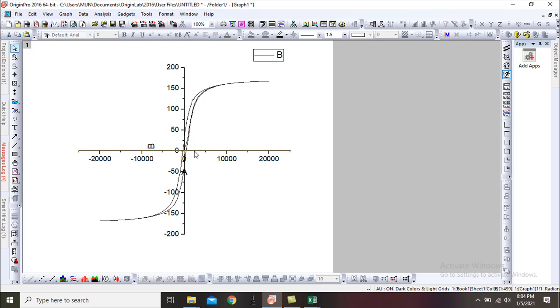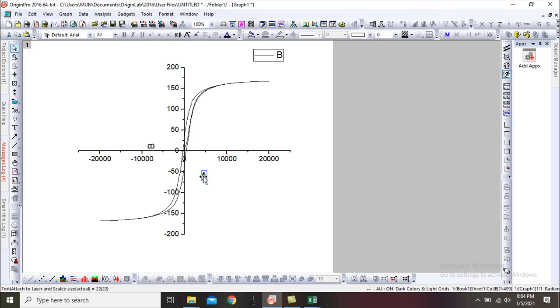You can use this graph in your research paper. Now I will name the two axes and save the file.